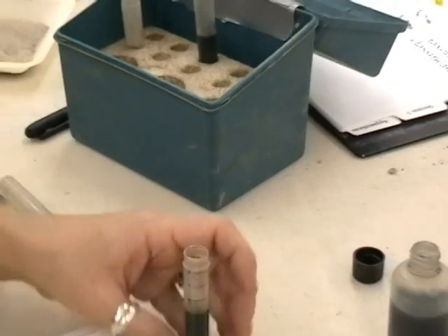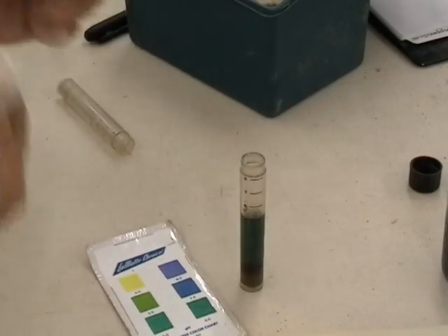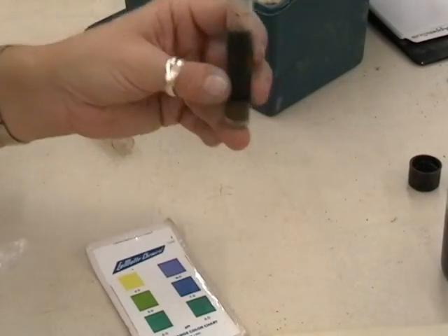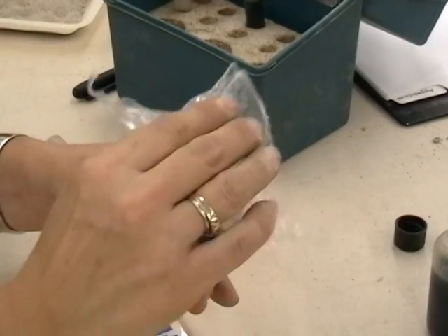We would like to cover the end with a piece of plastic so that when we shake it, we might not actually be transferring the pH of our fingers to the pH of our sample. Often you will have a little stopper that you can put in. If you don't, just use a piece of plastic and shake for approximately a minute.